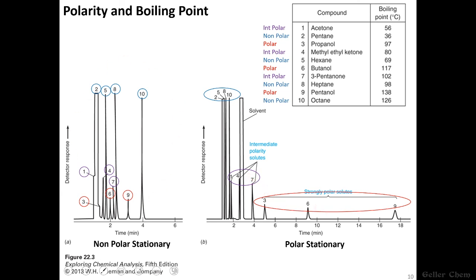The differences are not as striking, and that's presumably because the interactions between nonpolar solutes and a nonpolar stationary phase are not as strong as the interactions between polar solutes and a polar stationary phase, so you don't get nearly as much of a division between everything. But we can still make some clear observations.